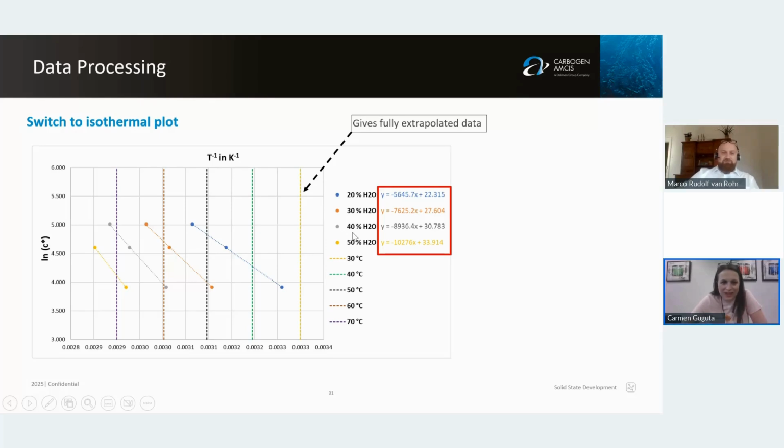Have you thought about plotting temperature, solubility, anti-solvent into a 3D survey? Yes. And then develop a crystallization road from there?